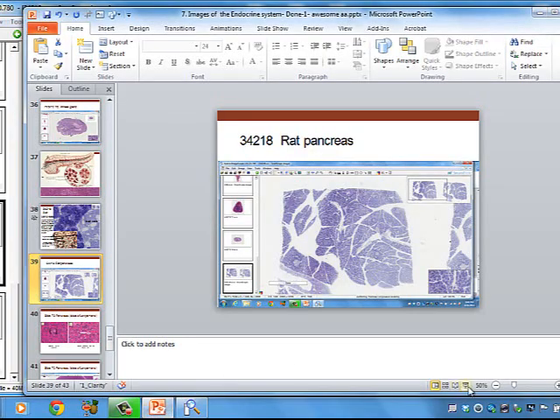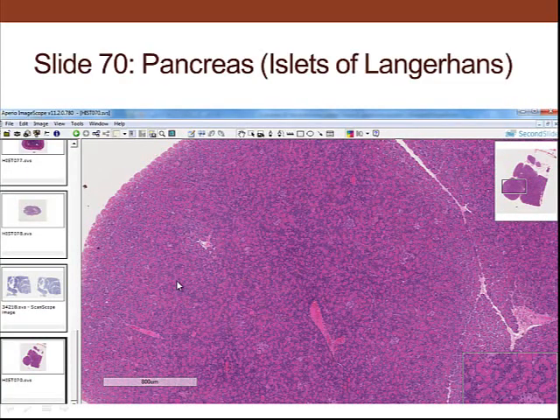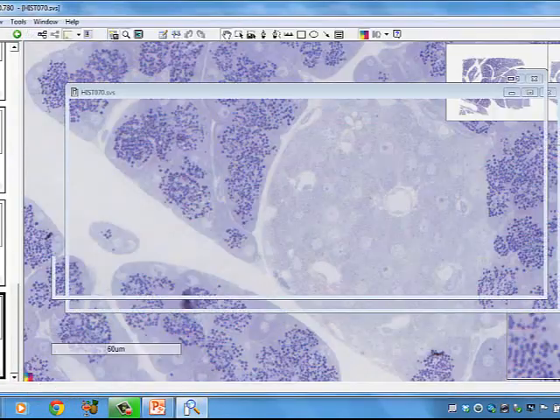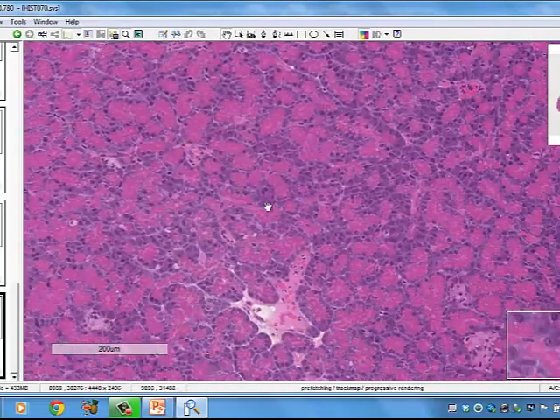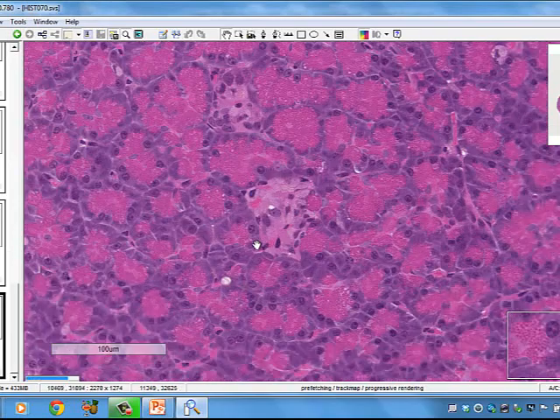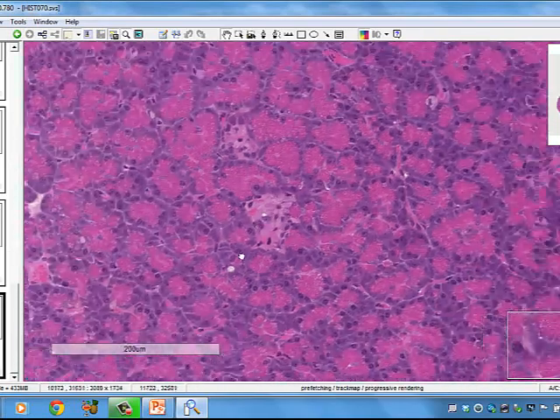So if we look at the pancreas, also another pancreas slide. These are pancreatic acinar cells. They have blue cytoplasm at the base, and then you have the secretions. You see the ducts that are there. If we take a look at that specimen, we'll be able to see the different, these are exocrine function, and then the endocrine that are located, lighter staining, that we see there.